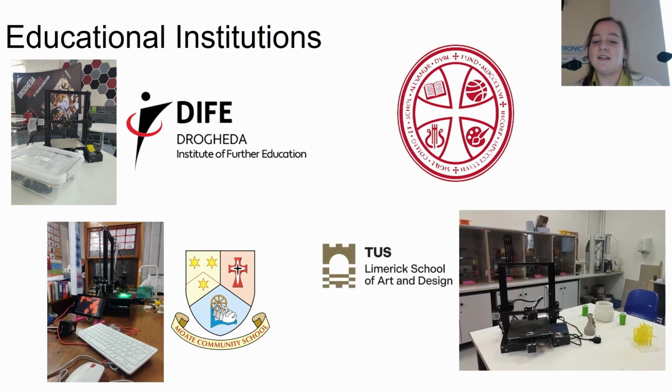And then we have Limerick School of Art and Design. This is a 3rd level institution, and these are sculptors and artists. This is so interesting because they want to use the samples that they're looking at under the EnderScope as inspiration for their sculptures, which is really interesting, I think. They also have a sustainability master's in this institution, and they want to look at the microplastics released from recycled synthetic fibers versus non-recycled to see if there's more or less.